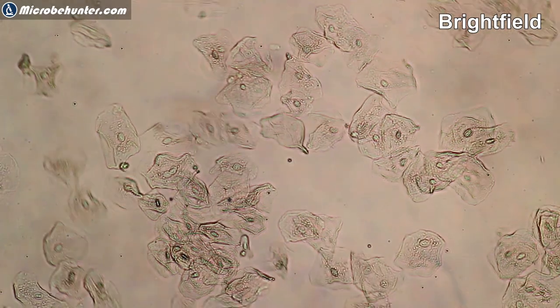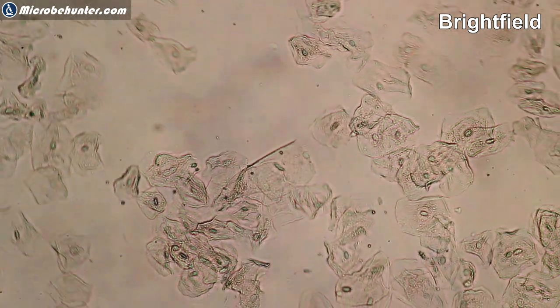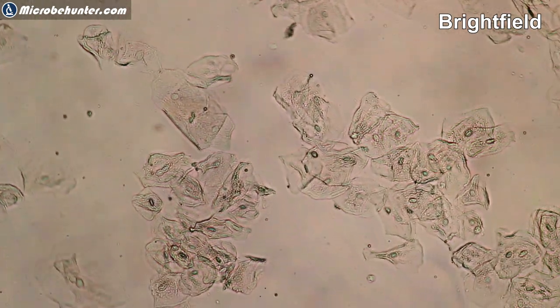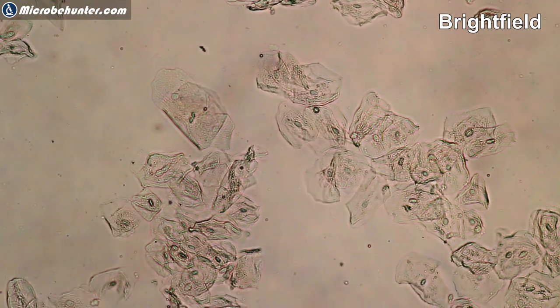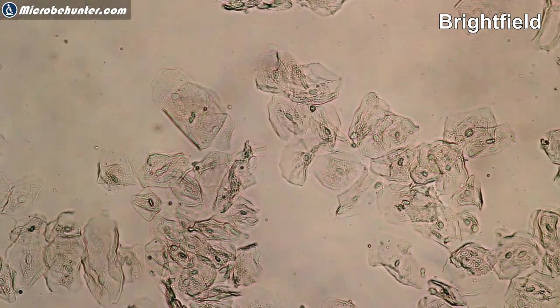That's my favorite part now. These are cheek cells, those that I promised you before. They're kind of floating around because I added water. And I think they look especially nice in phase contrast.